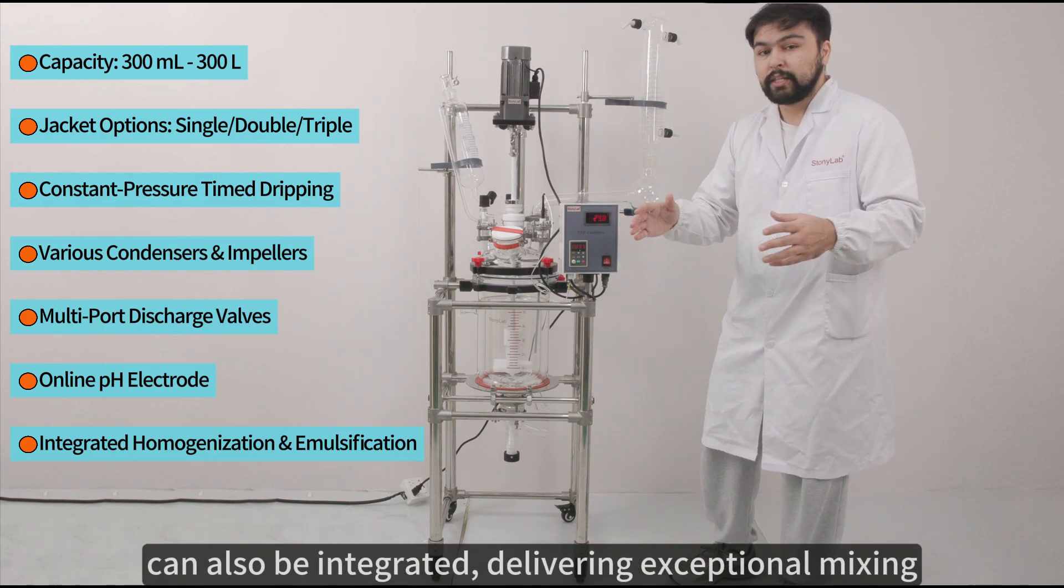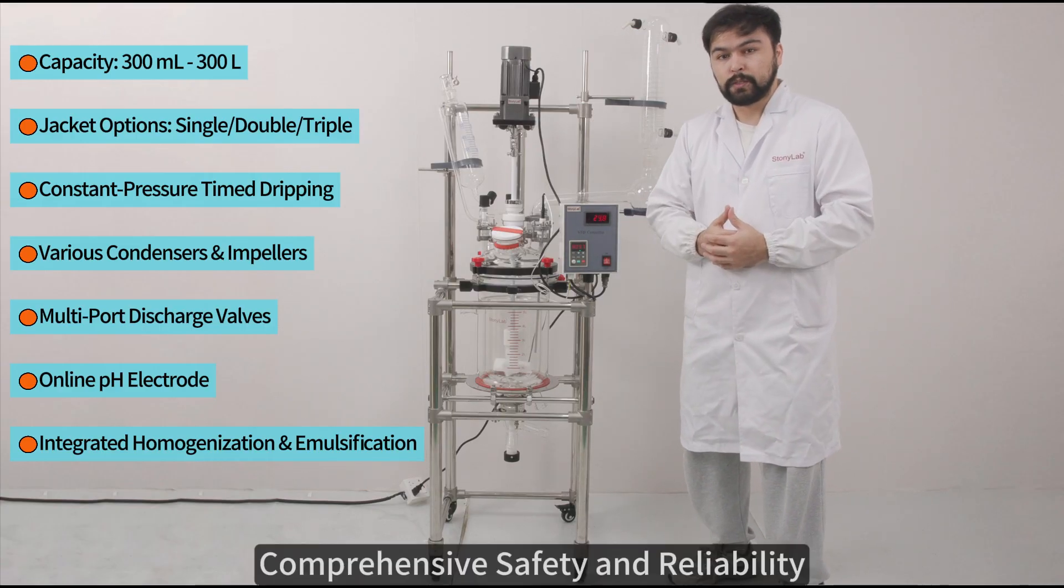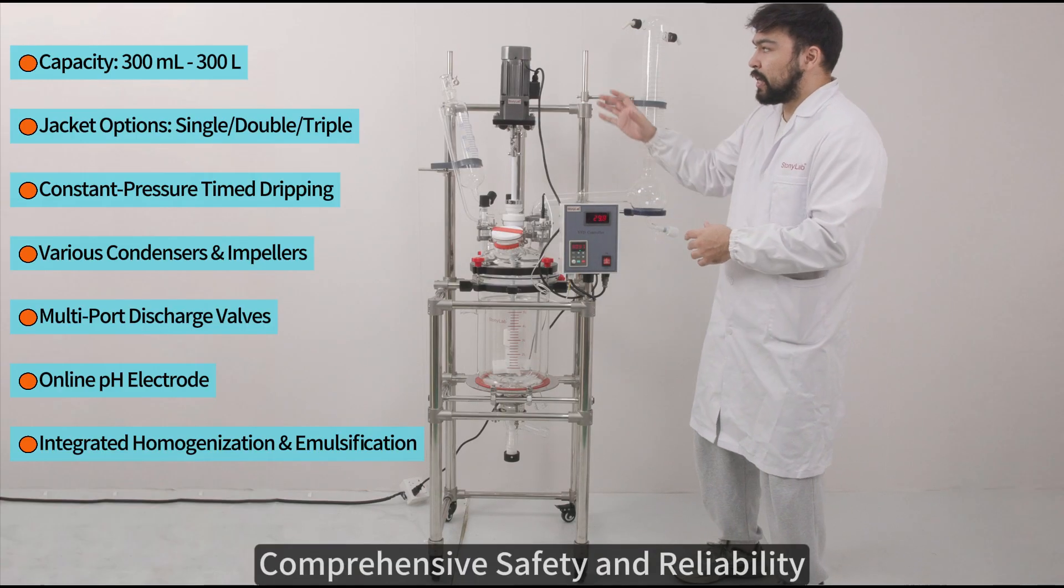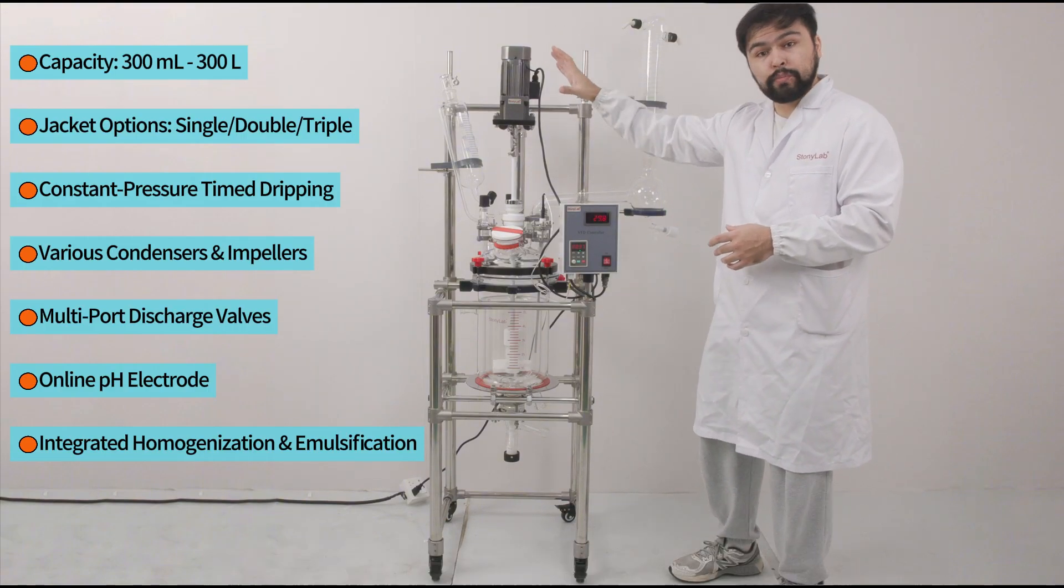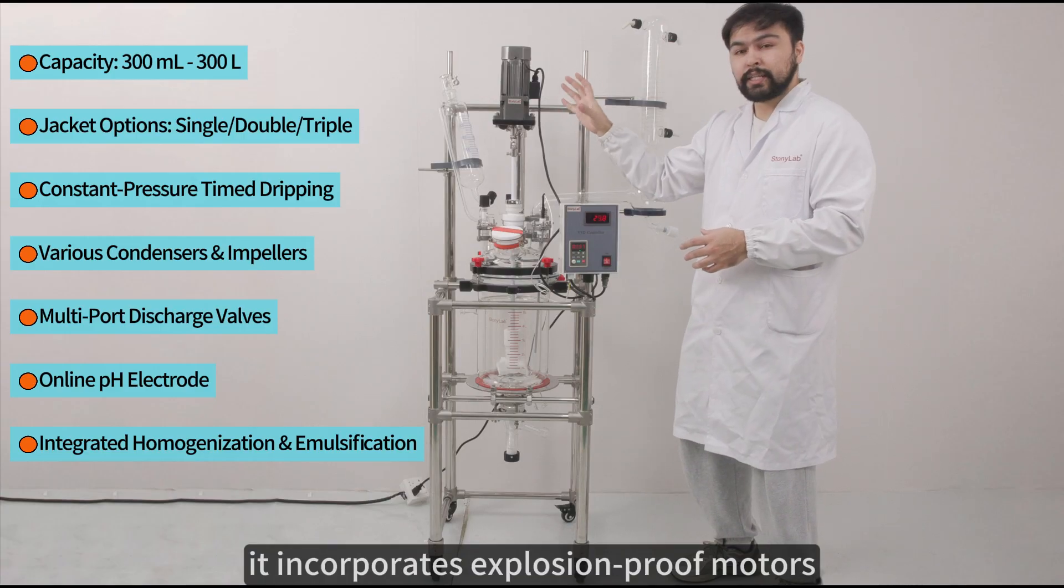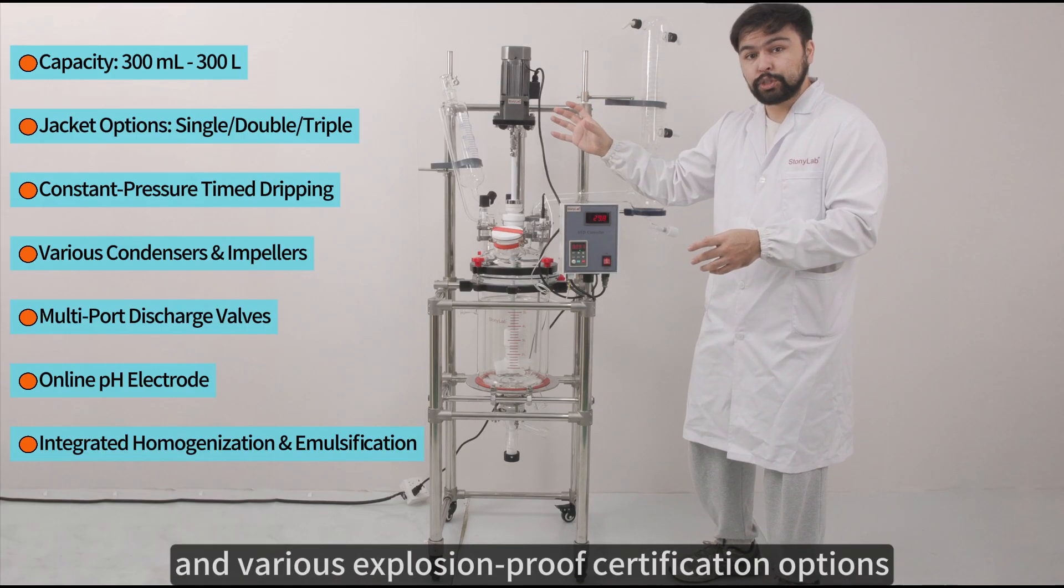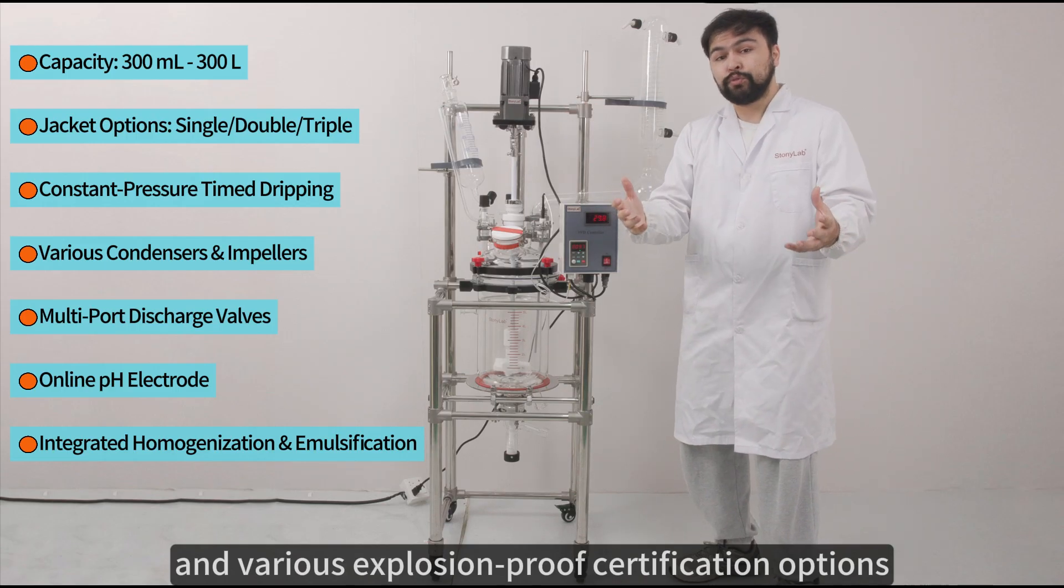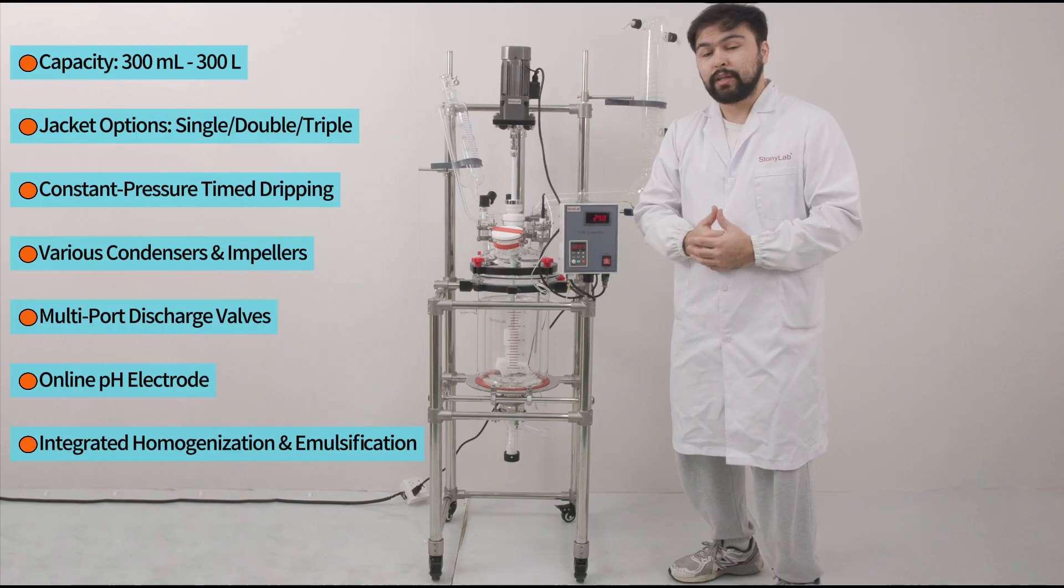This delivers exceptional mixing, reaction, and control performance. Comprehensive safety and reliability features prioritize equipment safety and durability. It incorporates explosion-proof motors, multiple high-vacuum sealing solutions, and various explosion-proof certification options to ensure secure and dependable operation.